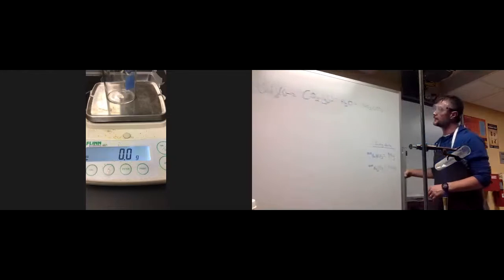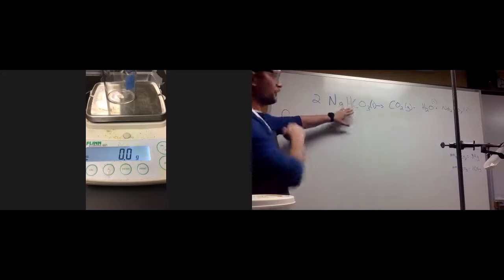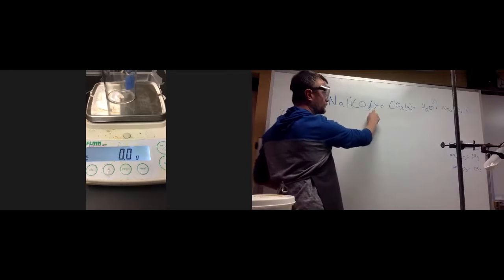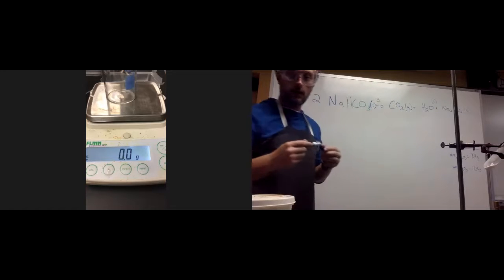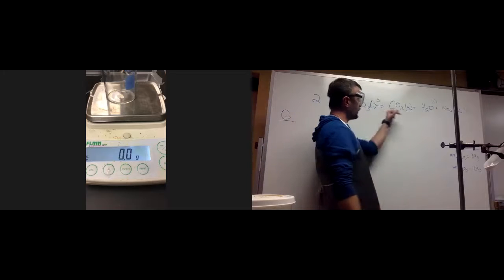Okay, so you can see on this board, maybe, kind of, that I have written the reaction. So I've got my sodium bicarbonate here, NaHCO3. That's my solid, and I'm adding heat. So eventually we will put something above the arrow to indicate that we're adding heat. Doesn't matter yet. Okay, so what's coming out of this test tube?